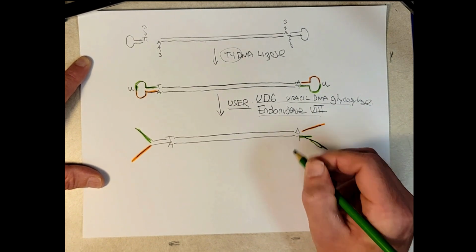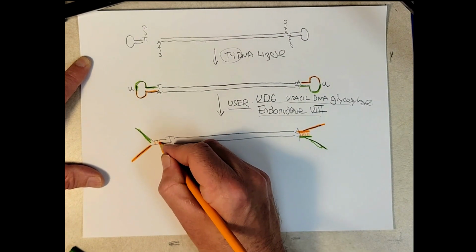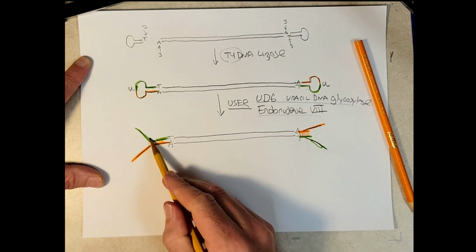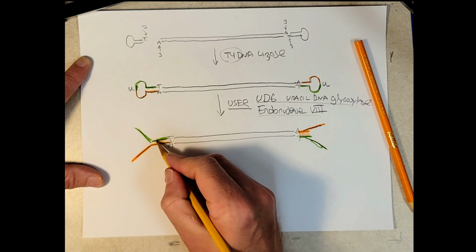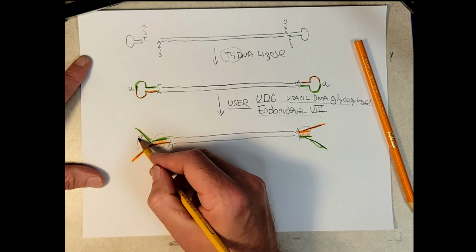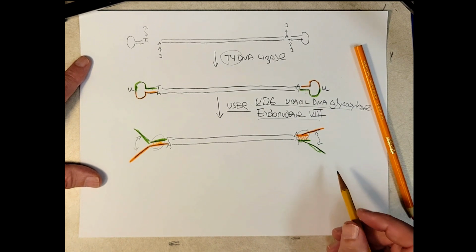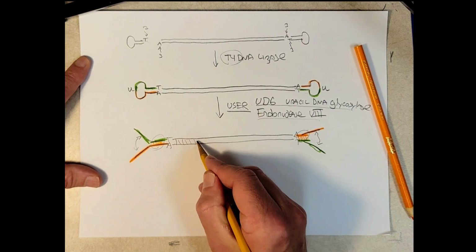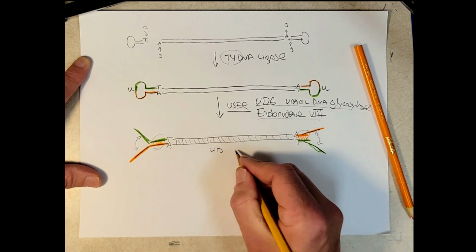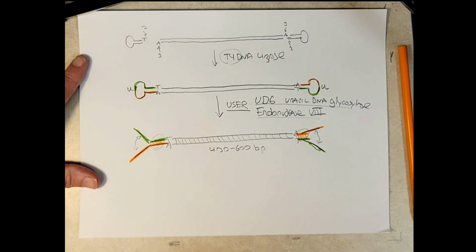And, oh, I got a little too messy here, sorry. So we have some bonds here, right? These are the adapter molecules, the green and the orange. They're stuck together right here, but they're not stuck together here anymore. They're not connected anymore, and they don't anneal because they are different sequences. And that's going to be important for the next steps. So all of our molecules should look something like this. And remember, the sequences between the adapters are 400 to 600 base pair fragments from throughout the genome that we're trying to sequence.